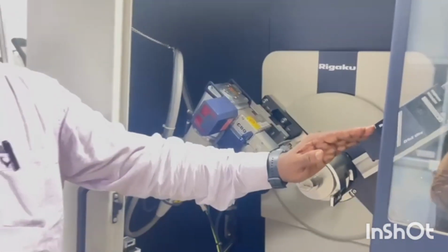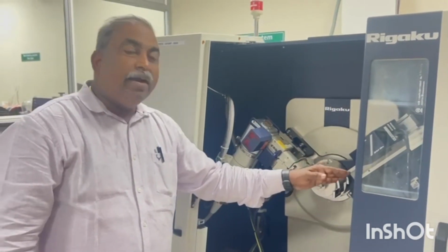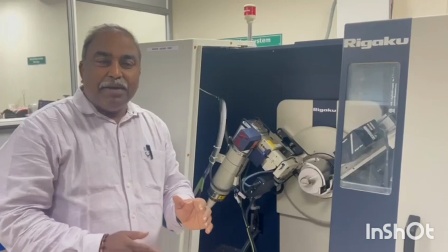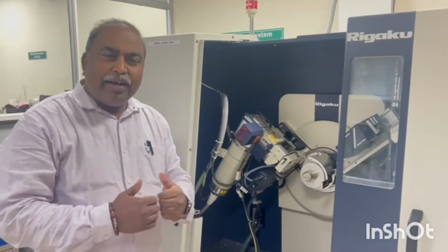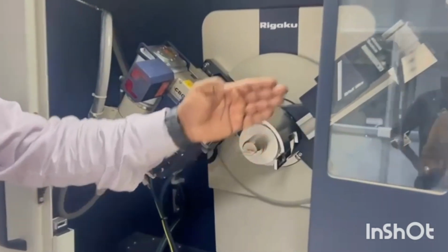Then the other part we have is a detector. Whatever X-rays are diffracted from the sample, we detect over here. Okay, that's the basic instrumentation part. Let us look at the components that we have. As already mentioned, it's the X-ray tube, sample holder, then detector.